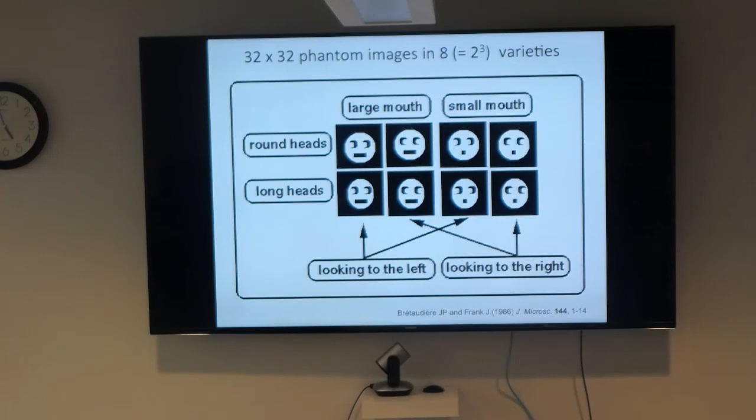I might avoid resolution in terms of FSC, but when you look at a map and you're trying to look at details that are meaningful to a structural biologist, what is your criteria that there's been a reasonable map? Because resolution is not the only criteria. Well, we don't do anything different from other people. There are certain criteria on what you should see at a particular resolution in terms of secondary structure and features of side chains and so forth.